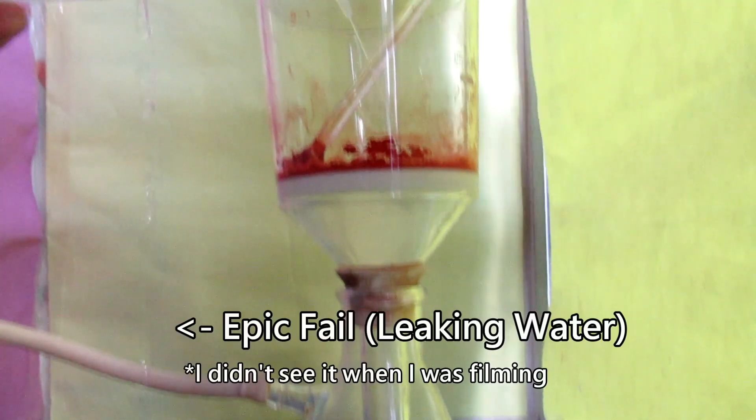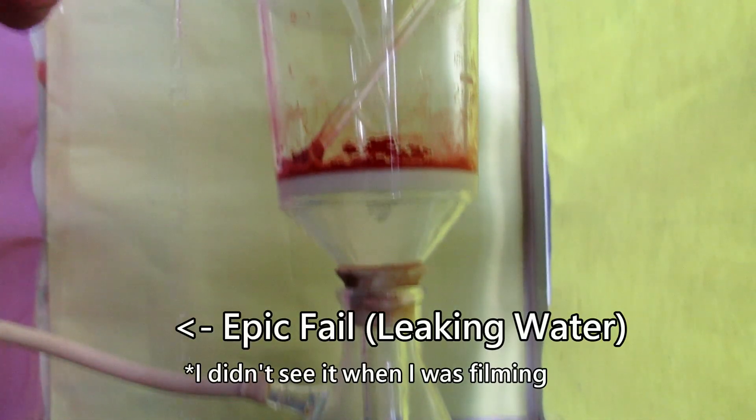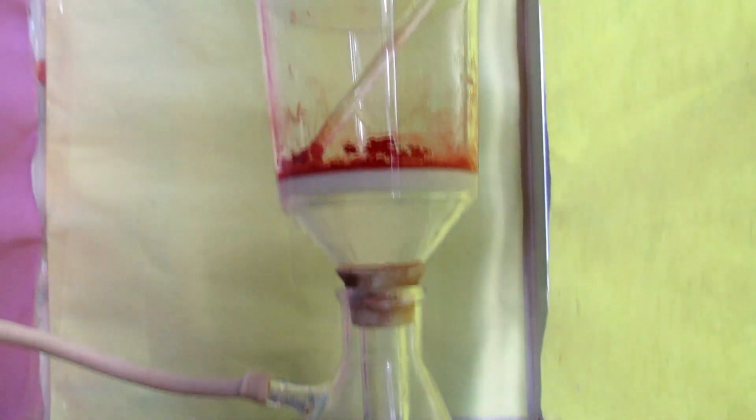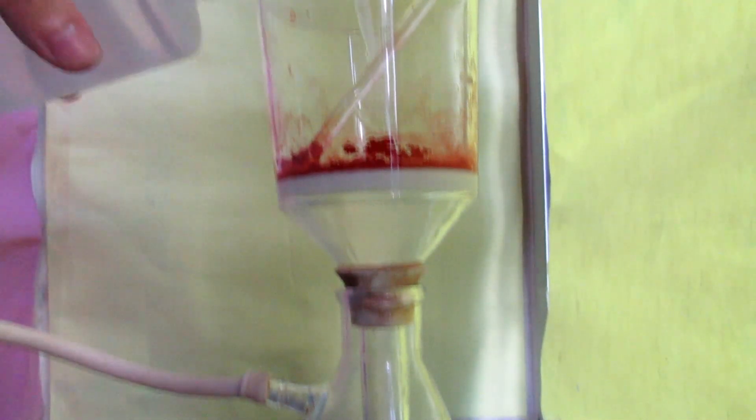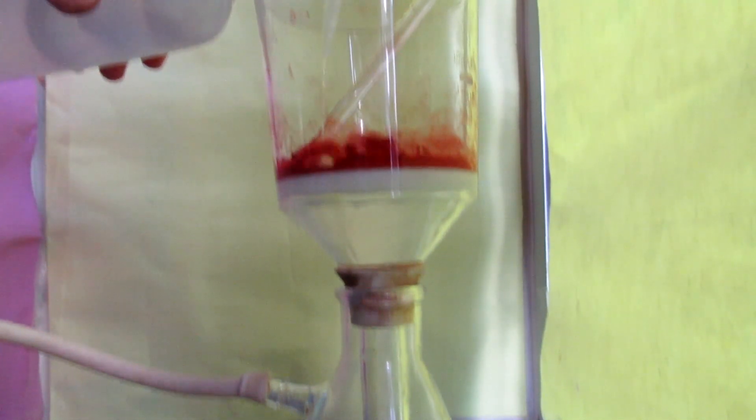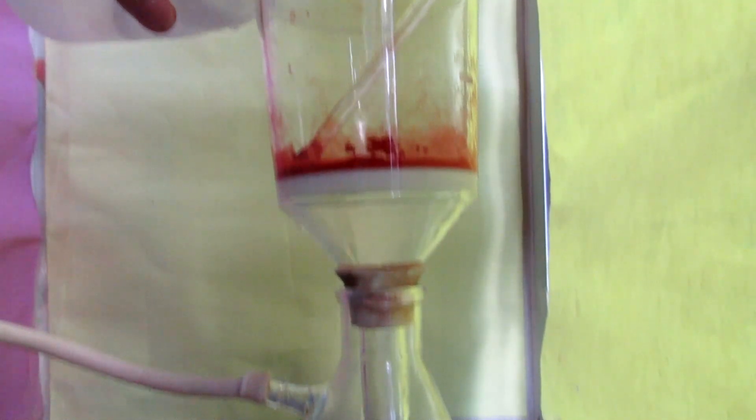After all the solution has been filtered through, I used some distilled water to wash the copper oxide to remove any soluble impurities like sodium, citrate, carbonate ions and sugar. Then, I left the vacuum on for a while to drive off as much water as possible. After that, I placed my copper oxide into a vacuum desiccator to further dry my product.